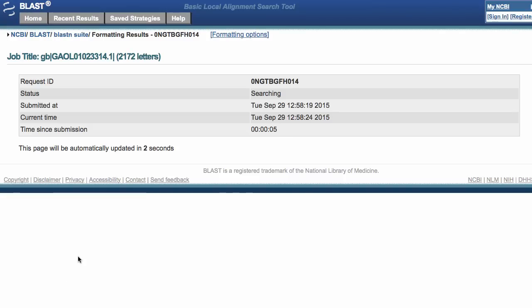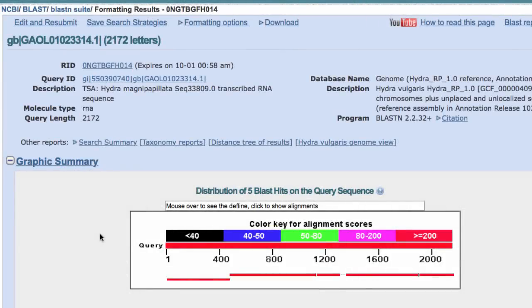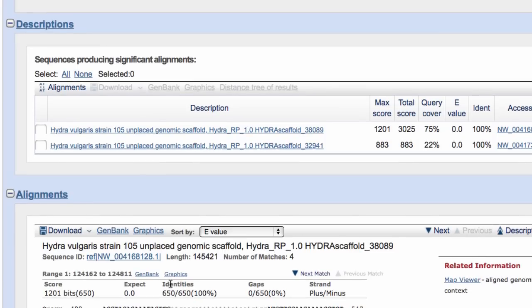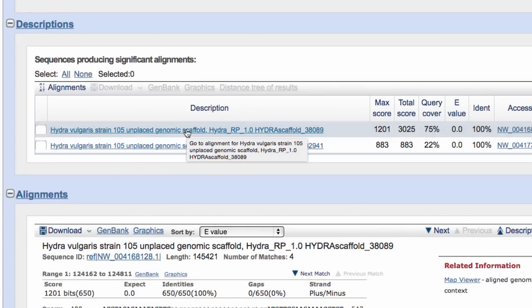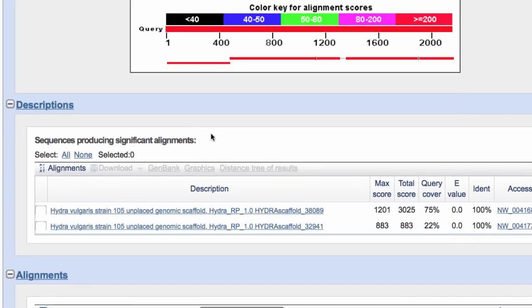This should run pretty quickly because it's a relatively small dataset. The search didn't take too long, and I can see that I have matches to database sequences. We can see from the descriptions that these are unplaced genomic scaffolds. Let's take a quick look at the graphic — one of the matches is quite a bit longer, and we see some vertical lines in the middle, indicating missing sequence.